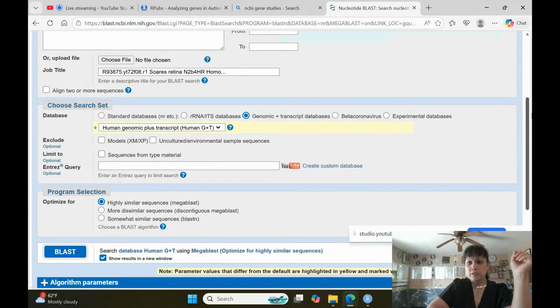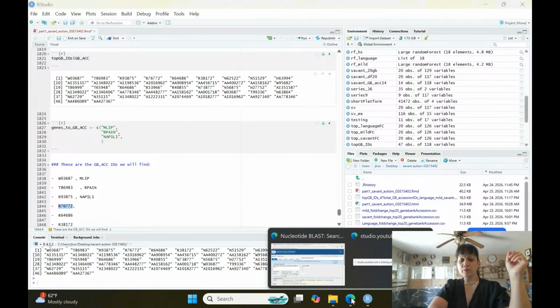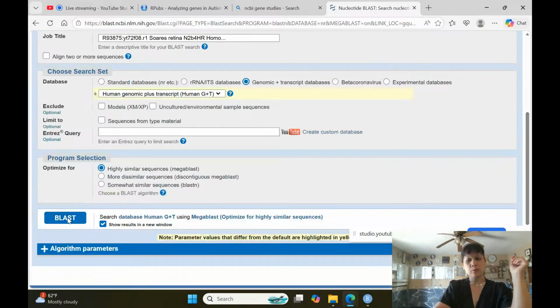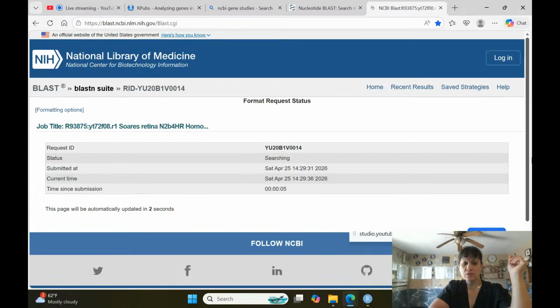We're going to go ahead and get our 4th gene bank accession ID, and then we're going to paste it in our new query box on BLAST. And we will go look for it as it searches.